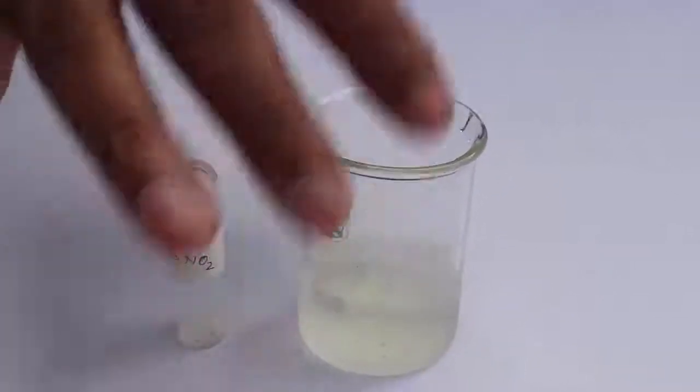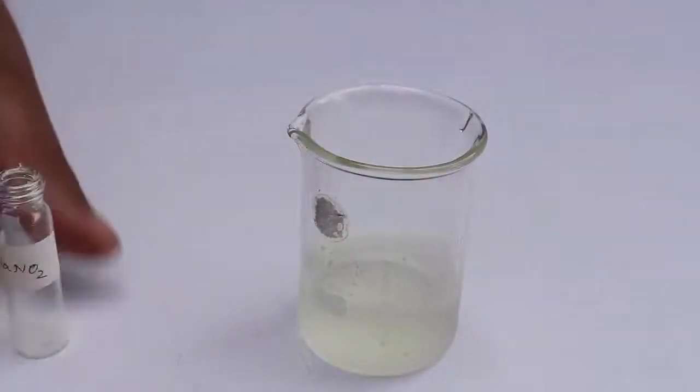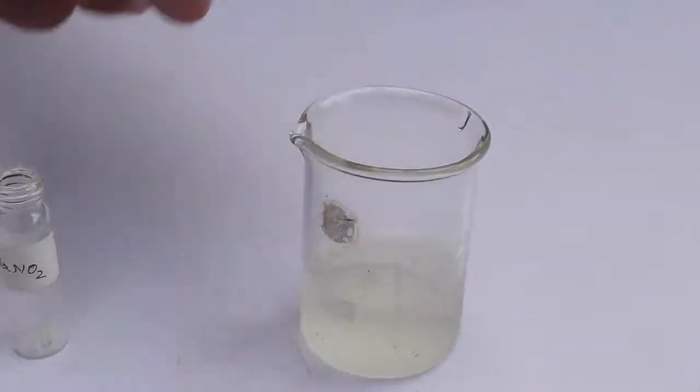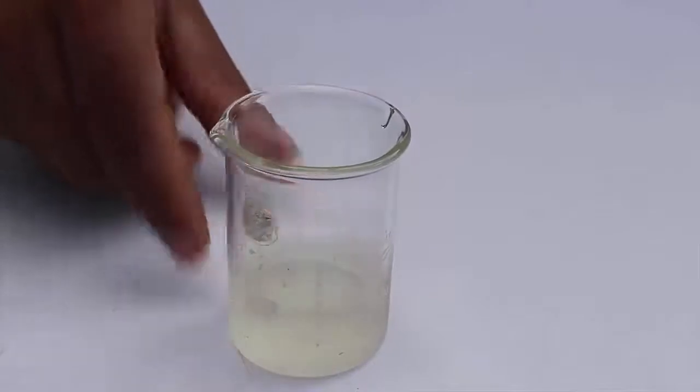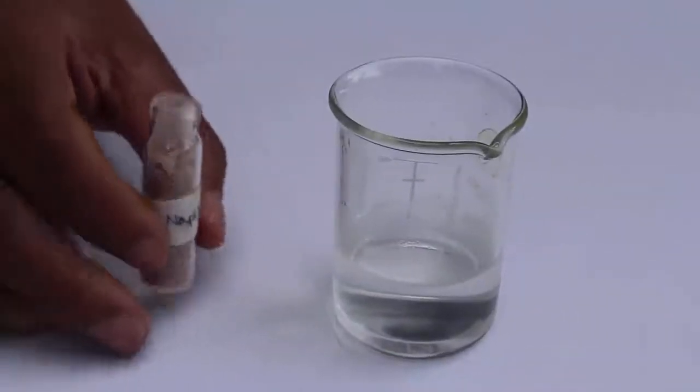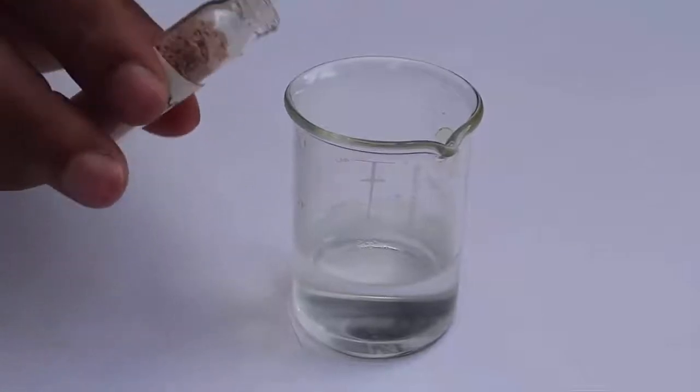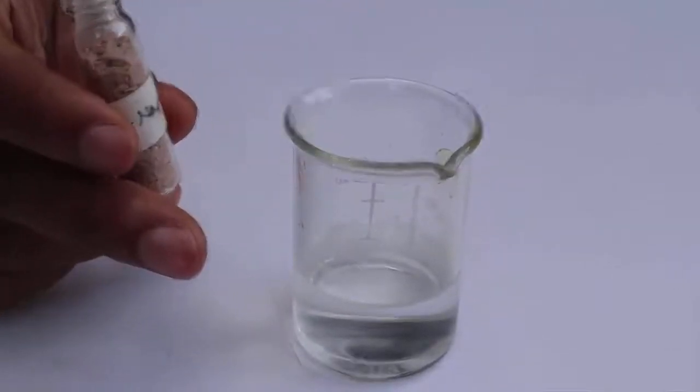Cool it down to less than 5 degrees centigrade by placing it in an ice bath. For the third solution, add 2-naphthol to the solution of sodium hydroxide or caustic soda.